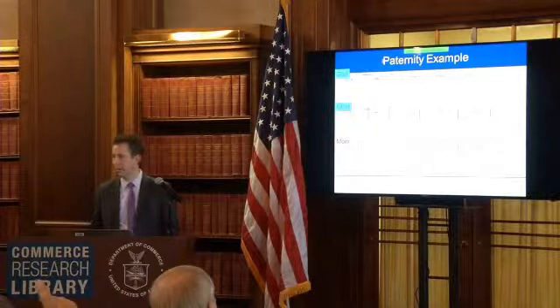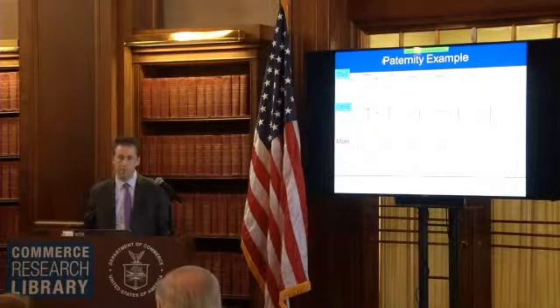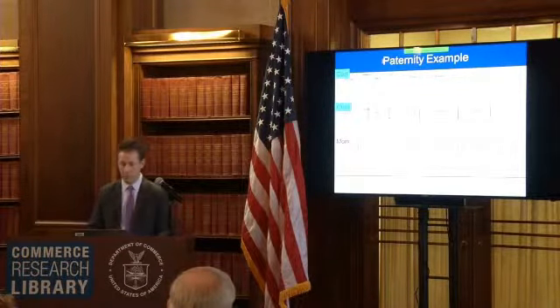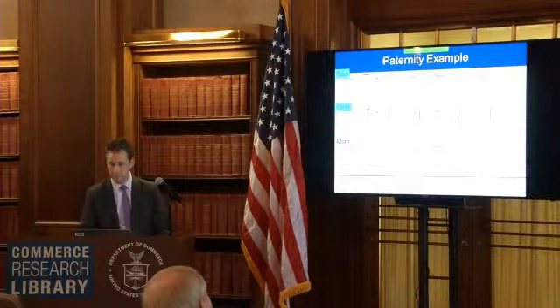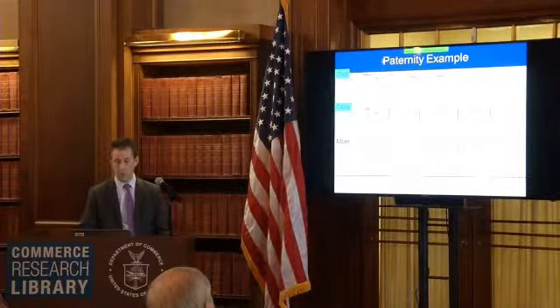There's another question up front. How come on that chart, the mom, dad, and child all have a 6, and the first 6 you show comes from the dad, not from the mom? But then over to the right, you have a 12, all three of them have 12, and it shows it coming from the mom and the dad. Why is that inconsistent? You mean this one here? Yeah, that's one from everybody. Right. And then go to the left, and there's a 7, and the 6. The 6 comes from the dad, but it doesn't come from the mom.